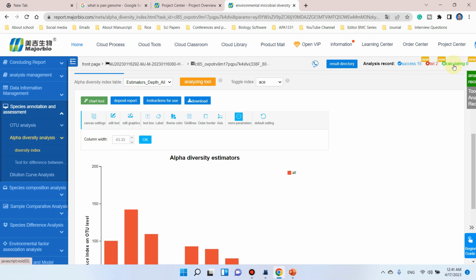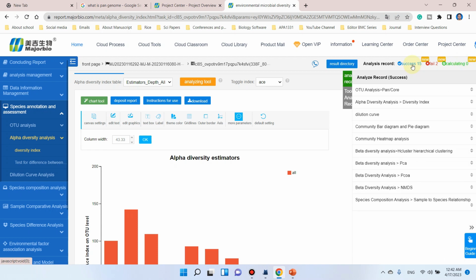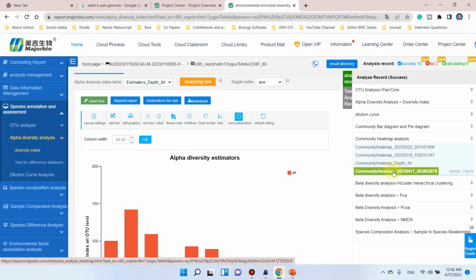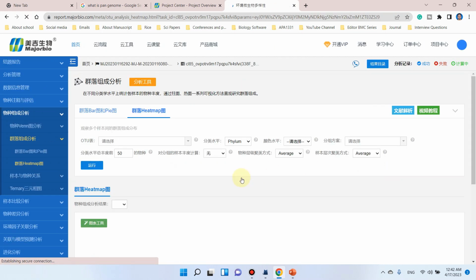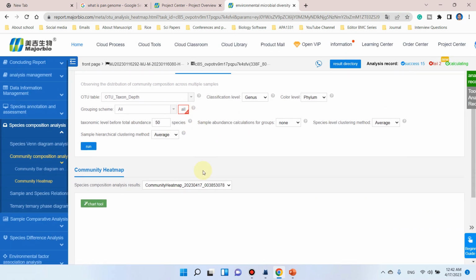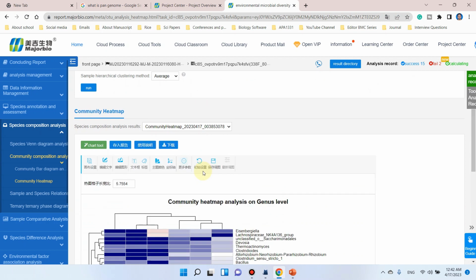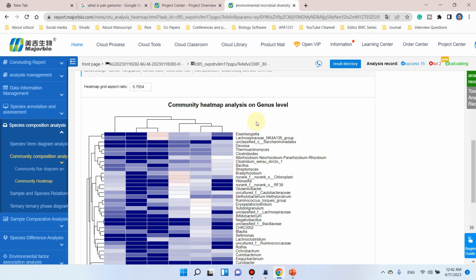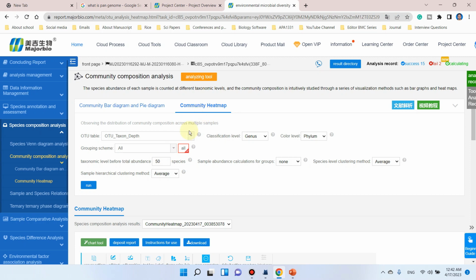You can see here, previously I showed which one was calculating. Now it has just been uploaded and finished, and we know that it was the heat map, and here it is showing in the green color. You can see our customized community heat map is being updated, and now we have a fine comparison of only control negative and control positive. Similarly, you can design your own community heat map and arrange them according to your need.